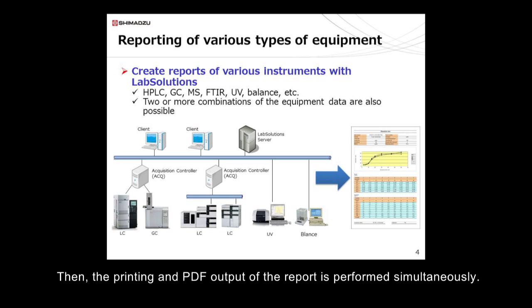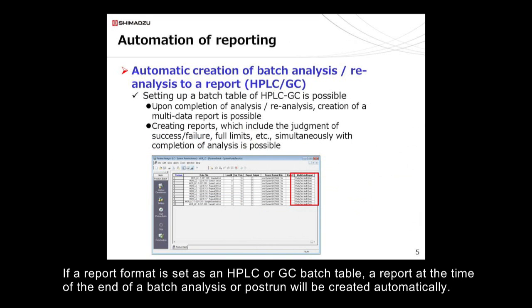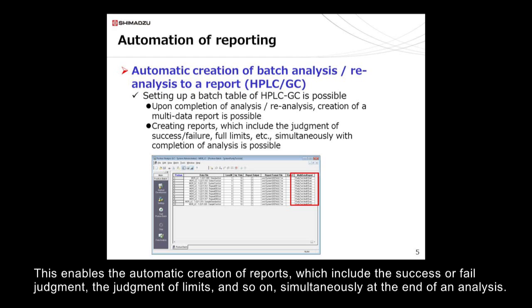The printing and PDF output of the report is performed simultaneously. If a report format is set as an HPLC or GC batch table, a report at the time of the end of a batch analysis or post-run will be created automatically. This enables the automatic creation of reports which include the success or fail judgment and the judgment of limits simultaneously at the end of an analysis.